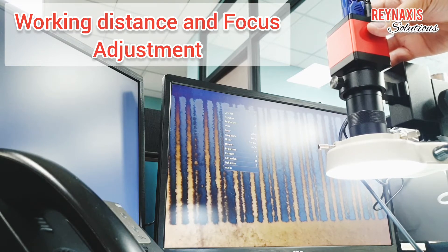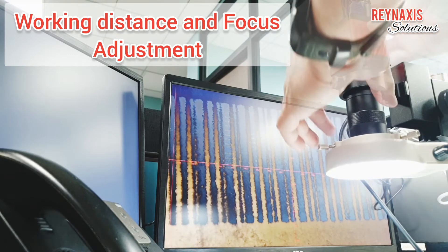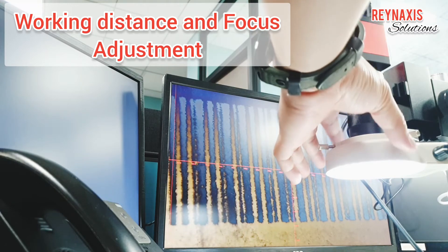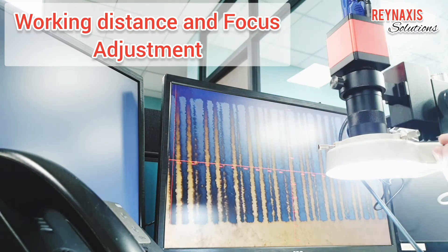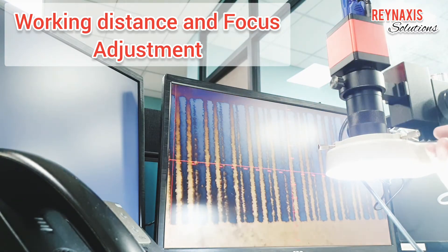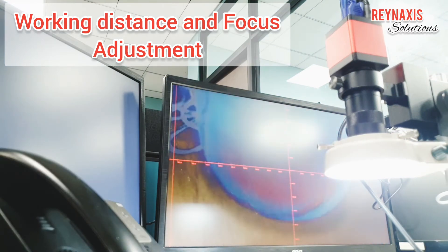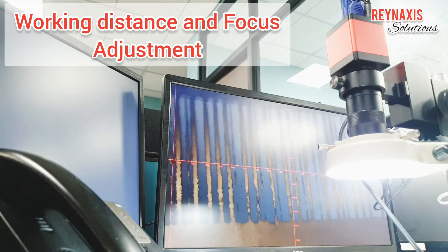The only thing I didn't like is that it didn't have a port for TF cards or SD cards, so I cannot directly record from this microscope. I can only point my camera at the screen so you can see what's going on.